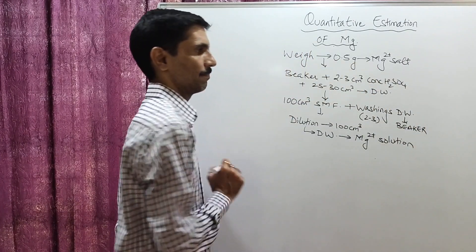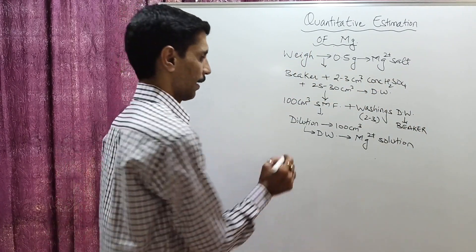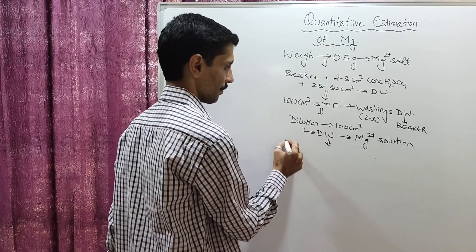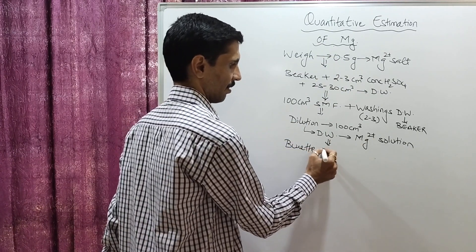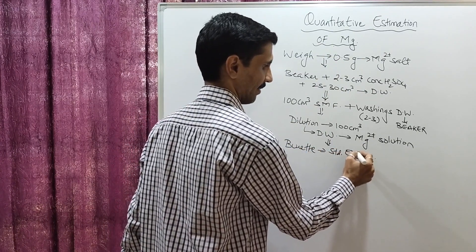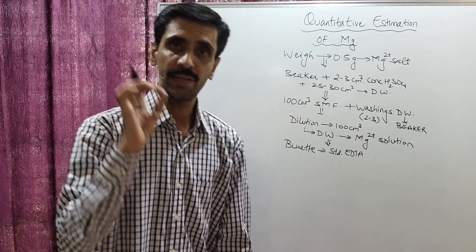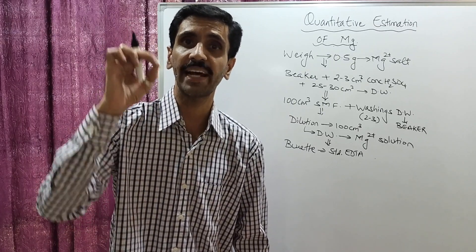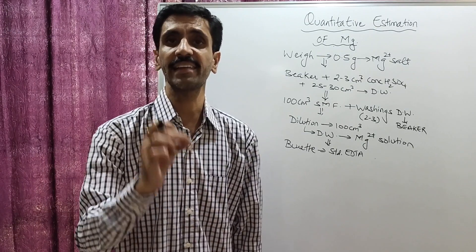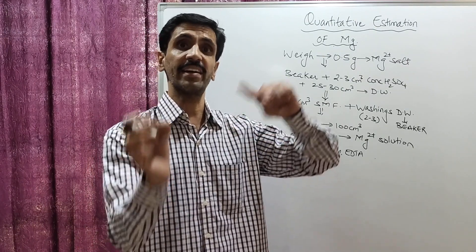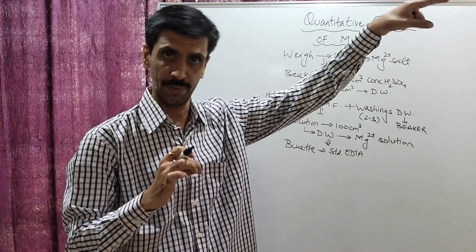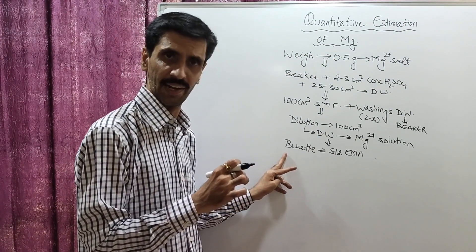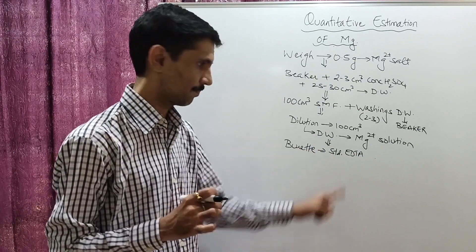Next step is filling the burette with standardized EDTA. Standardized EDTA means you already know its concentration before carrying out the titration — the EDTA has been standardized previously using zinc sulfate. Rinse the burette with the EDTA solution, then fill it up to the 0 mark with the standard EDTA.